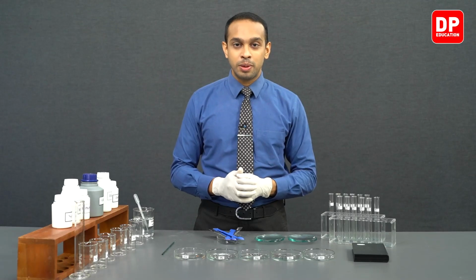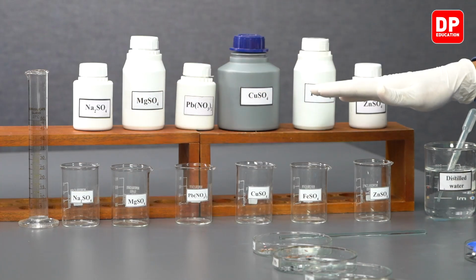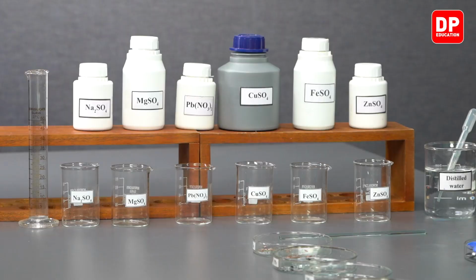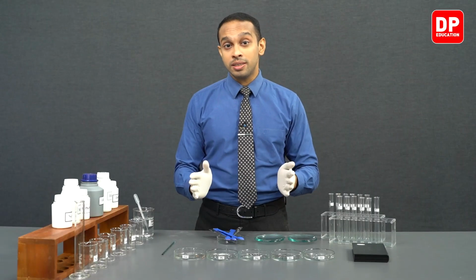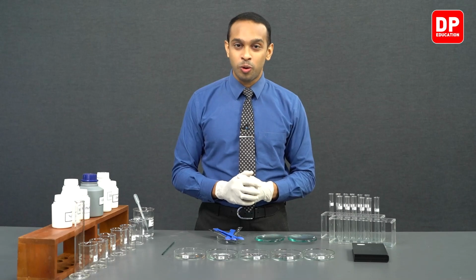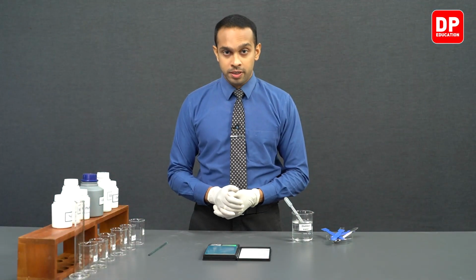In the first step of our experiment, we will be preparing the solutions needed for this experiment. So we are going to measure the right masses of each of these solids, and we are going to prepare 50 milliliters of each of these solutions. So let's move on to that part of our experiment. Now students, let's prepare our first solution.